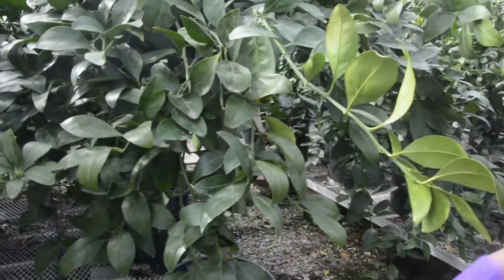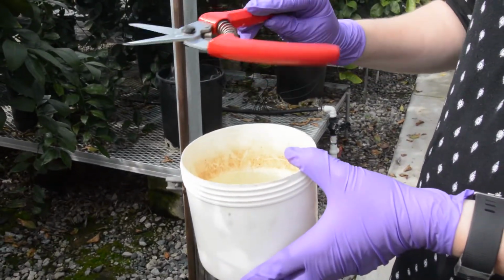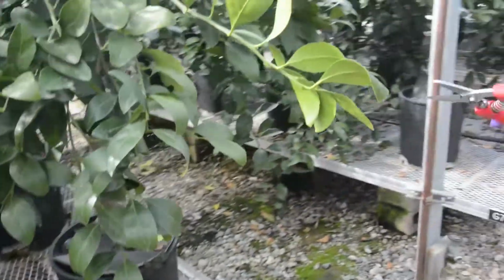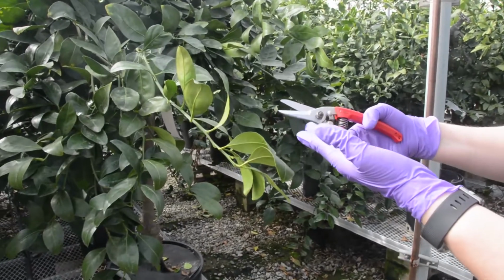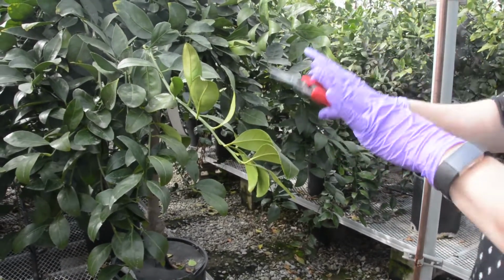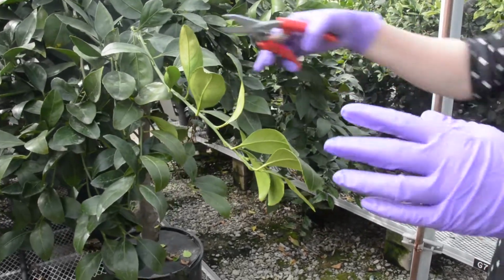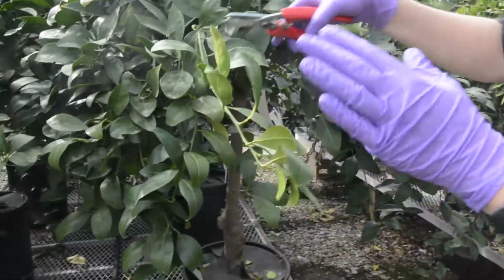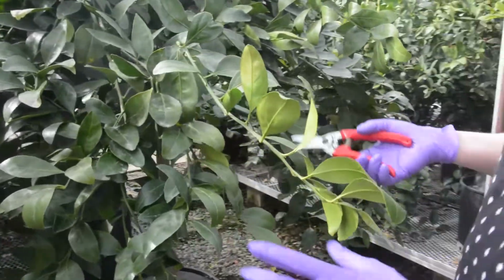We use a bleach water solution, about a 10 or 20% bleach solution. And we use these pruners that have been sitting in the bleach for about 1 minute. You want to make sure that it is nice and sterilized. It's just the best practice to use pruners that have been sterilized. Even though these trees are tested clean, you don't want to get into the practice of using this pruner on several different trees. You want to use this for the one tree, then dip it in the bleach and then use it on another tree, so you don't transmit anything if it has anything.